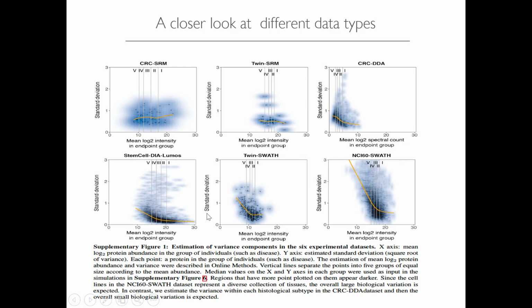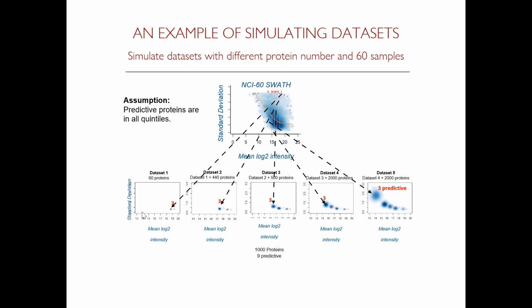But in any case, what this shows is that the field is progressing with improving the instrumentation to generate increasingly very, very nice data from the point of view of the noise behavior and the number of proteins covered as well. Okay, now that was just a side note to say that the field actually is progressing quite rapidly also from the data acquisition side.